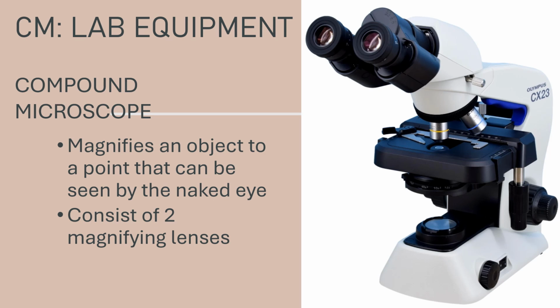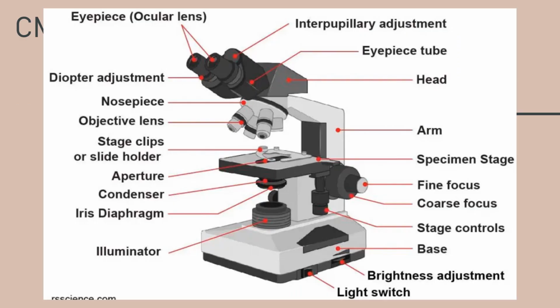In the field of clinical microscopy, it magnifies urine sediments like your red cells, white cells, epithelial cells, microorganisms like bacteria, and crystals are also magnified and observed in this one. It provides a detailed examination of your biological fluids, in the case of semen analysis, urine analysis, and the analysis of your CSF, to assist in the diagnosis of diseases. Let's take a look at your parts.